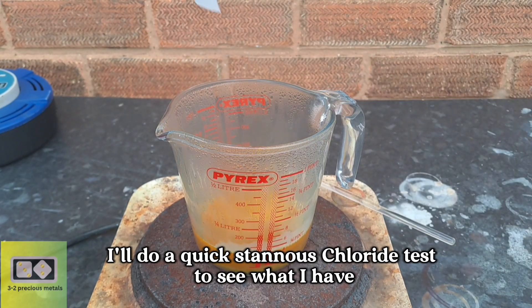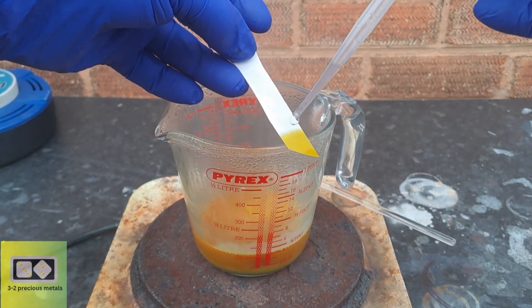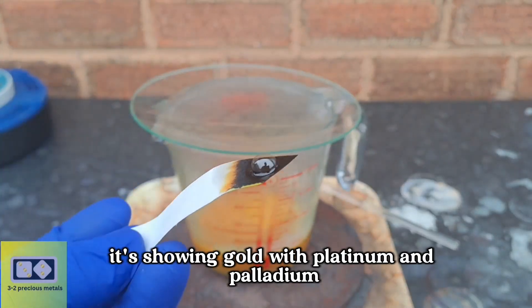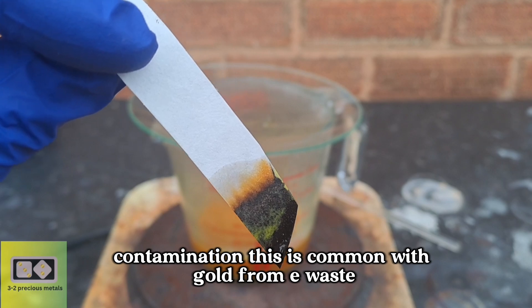I'll do a quick stannous chloride test to see what I have in solution. It's showing gold with platinum and palladium contamination. This is common with gold from e-waste.